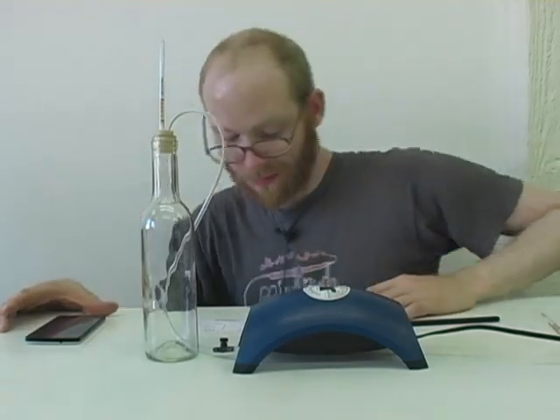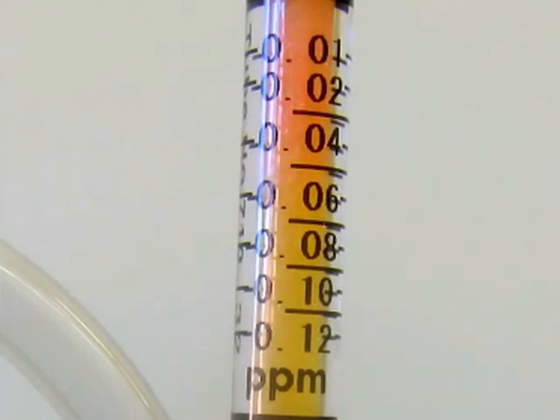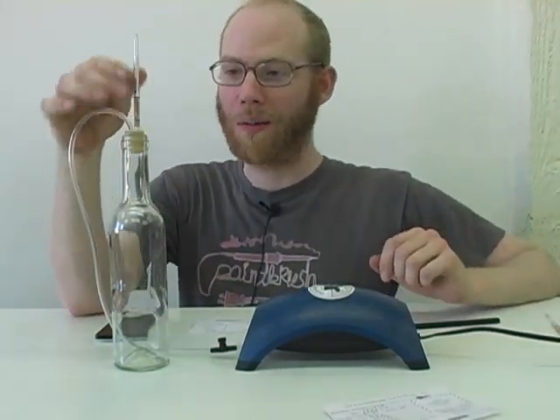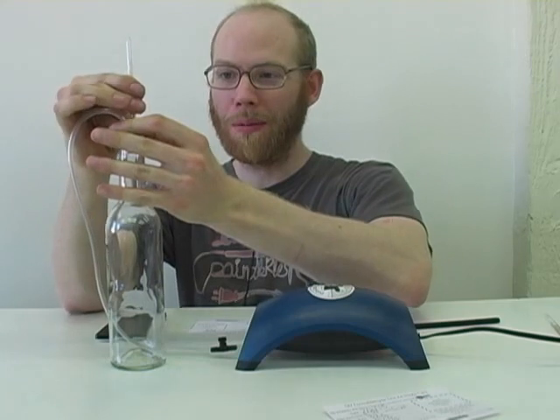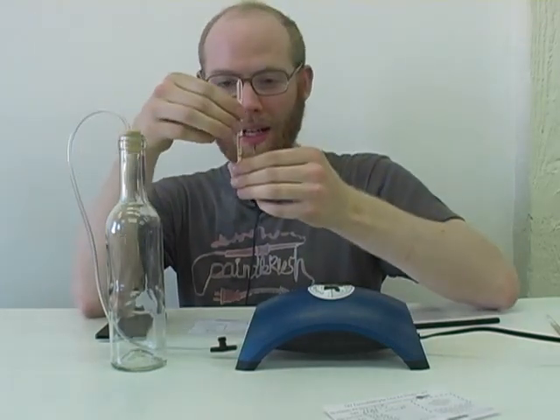All right, I'll be back in half an hour to check this sample out. Okay, so we're done running the 30-minute test. I've turned off the pump and now I'm going to pull out the tube and take a look at it.